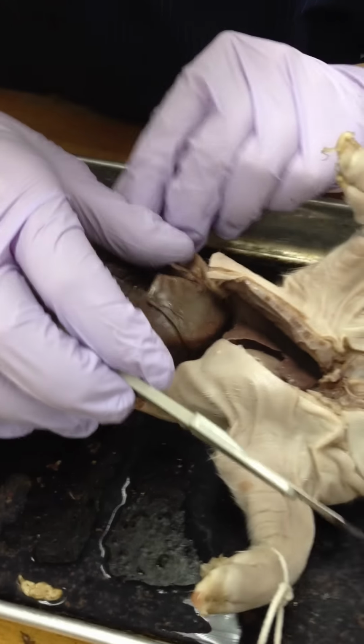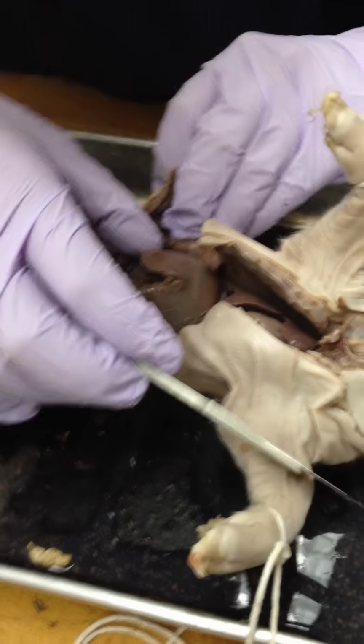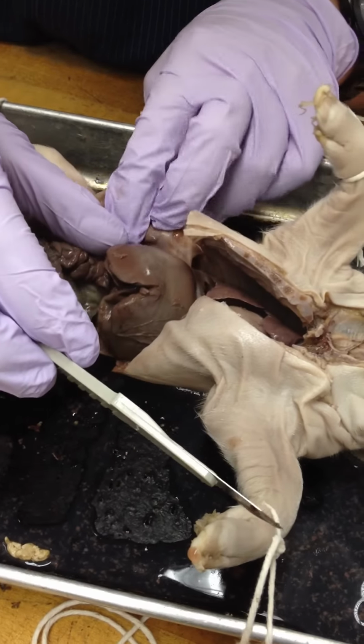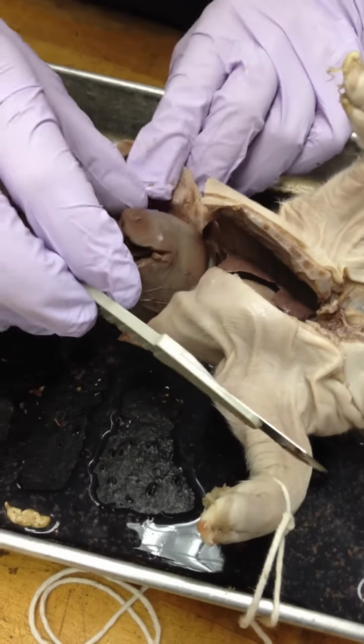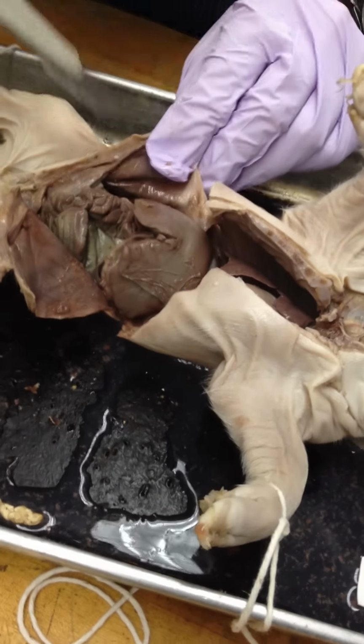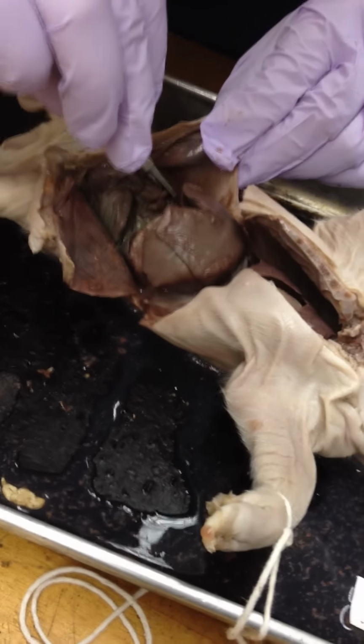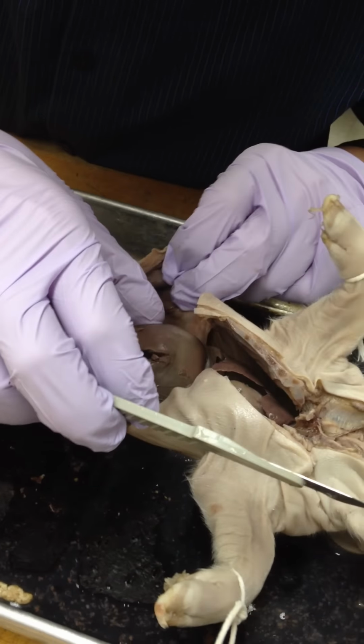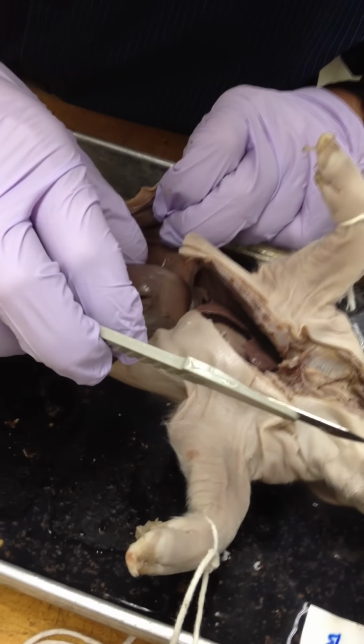Where was the page that has the digestive tract? Okay, there you go. Okay, there's one of the kidneys in the back, right there, by the way. Spleen. That is the spleen. Yeah, that's the spleen. Okay, where's the pancreas? Doesn't say anywhere pancreas in here, does it?